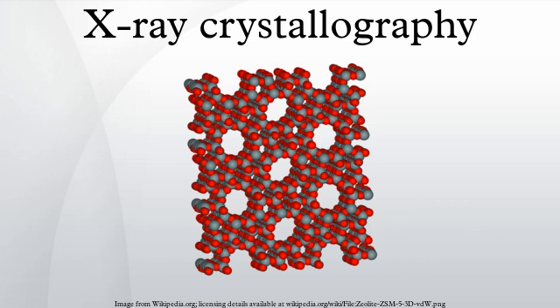Since many materials can form crystals such as salts, metals, minerals, semiconductors, as well as various inorganic, organic and biological molecules, X-ray crystallography has been fundamental in the development of many scientific fields. In its first decades of use, this method determined the size of atoms, the lengths and types of chemical bonds, and the atomic scale differences among various materials, especially minerals and alloys.